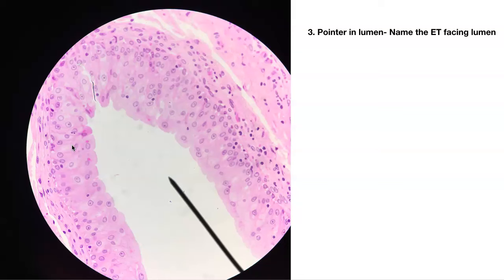Number three. Pointer in the lumen. We know this is stratified — more than one layer thick. But look at those apical cells; these are weird dome-shaped cells. This one looks like it's got two nuclei in it — just weird-looking cells. This is transitional epithelial tissue.